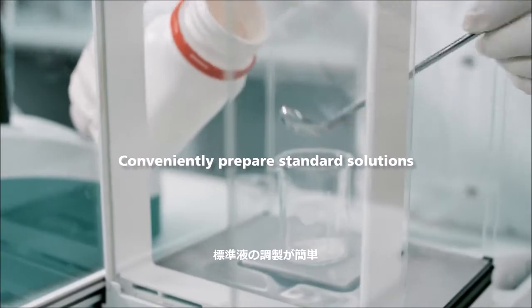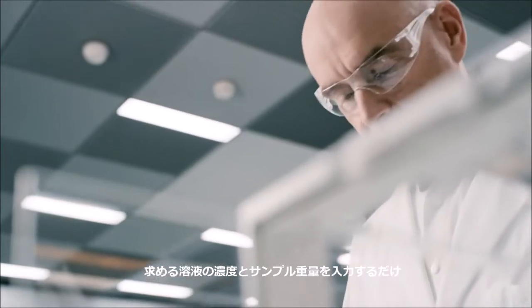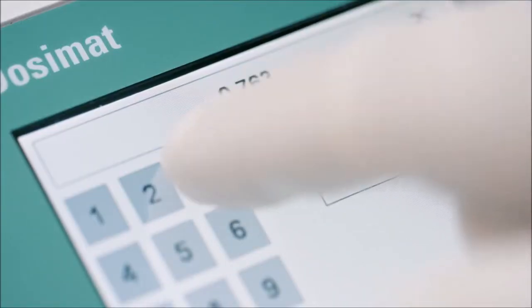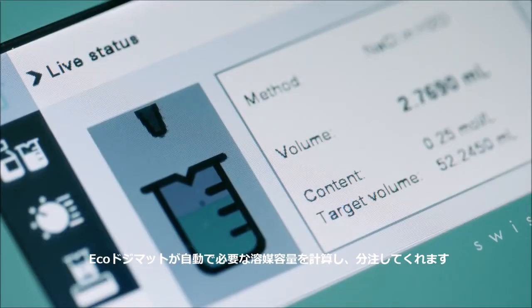Conveniently prepare standard solutions. Simply enter the required target concentration and the weight of the sample. The EcoDosomat will calculate and add the required solvent volume automatically.